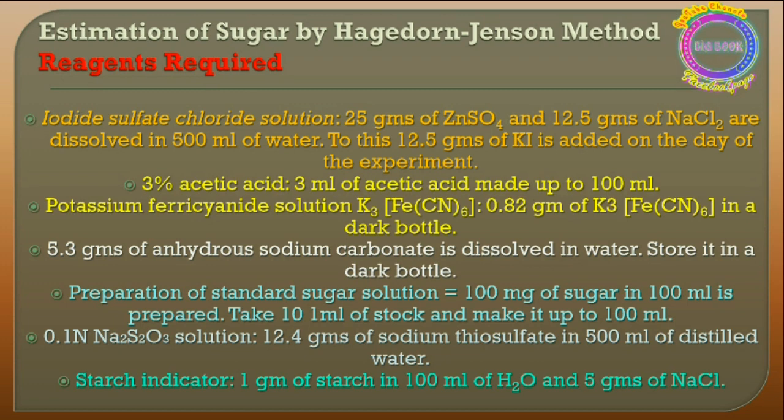Further, we are going to take 3% acetic acid. We prepare the 3% acetic acid, which we can also prepare on the day of the experiment itself. In this we take 100 ml of distilled water and add 3 ml of acetic acid to that.